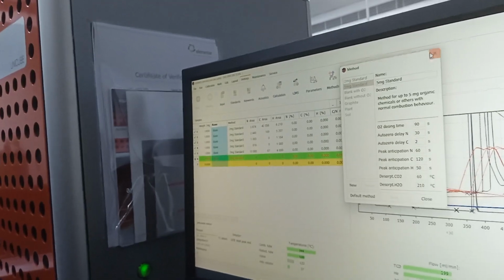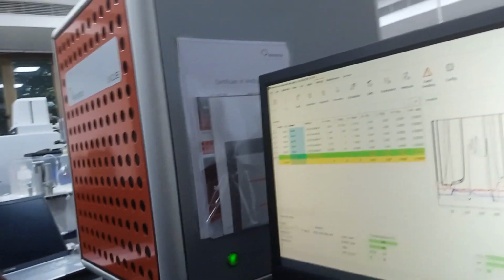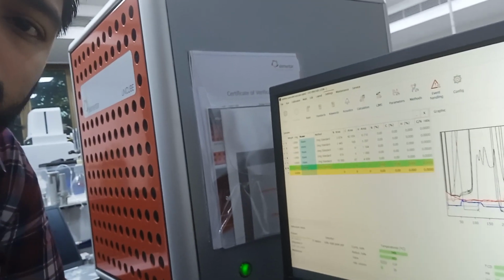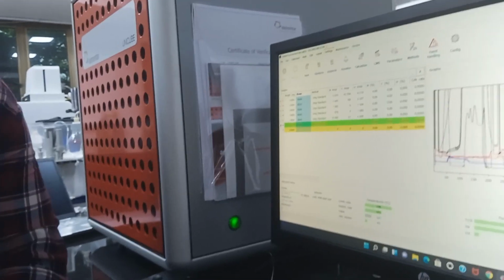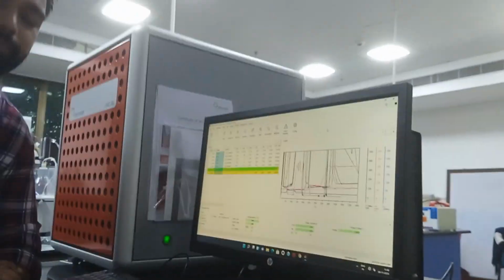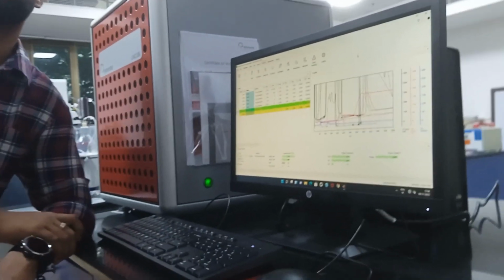My second question is, if you are dosing the sample with O2 for 90 seconds, is it the standard protocol you follow for every sample? How do you judge that you have to dose a particular sample for a certain time period? Here the dosing time is given as 90 seconds. If I dose it more or less, will that be sample dependent?